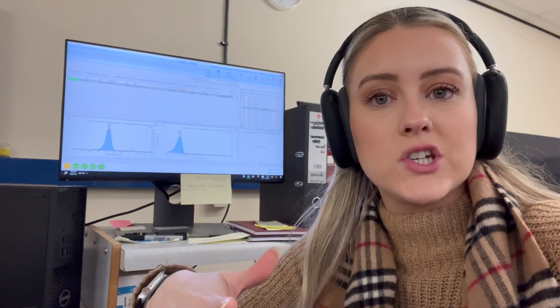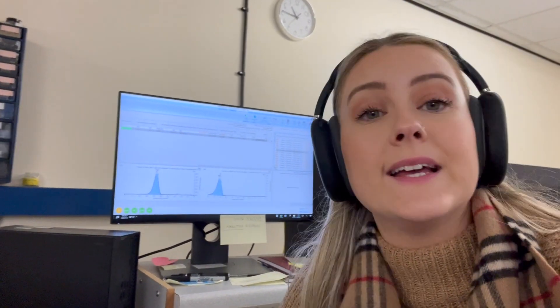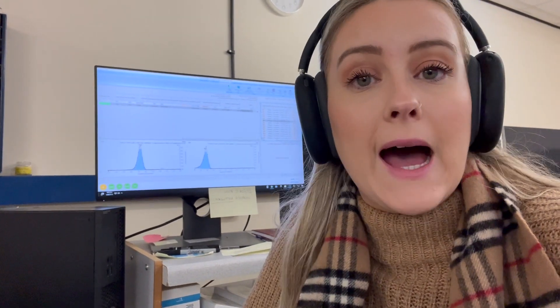I have not long finished lunch and I ran a standard while I was having my lunch. I'm now checking the peaks because I need to check if the retention times are okay, as this analysis is a bit tricky. Sometimes the peaks change retention time from run to run, which is annoying. So I need to make sure the retention time is okay and I can alter the method if not, and set it all up ready to run my samples.